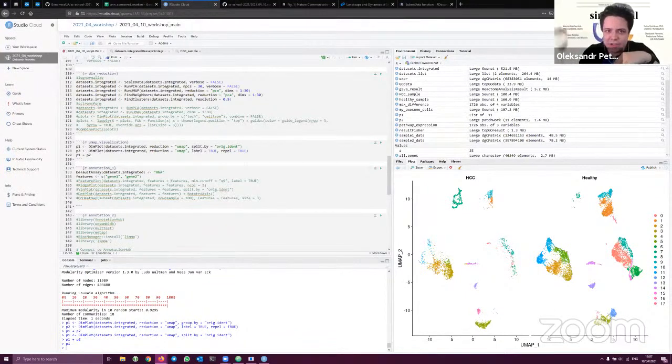I know that there are crazy mathematicians working on that, and can tell you very deep math related to it. But I just know that UMAP is somewhat more trendy right now in such kind of data sets. So there's a lot of ways how you can reduce the dimensionality, and UMAP is just the standard way, the first step you can use. And I honestly think in most of the single cell RNA-seq data, it will just perform very well.